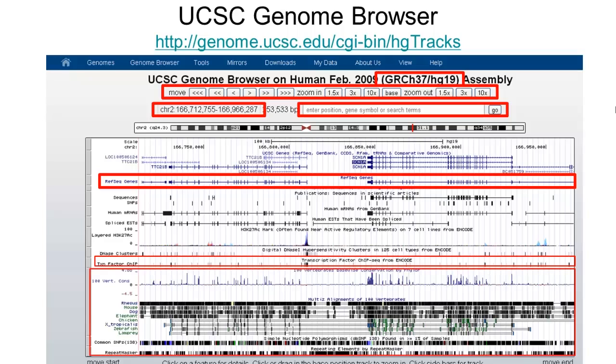An important feature of the UCSC Genome Browser is the conservation profile that it calculates across species. Here, for the human genomic region, you are looking at the multiple sequence alignment and evolutionary conservation across 100 vertebrate species. The alignments were done by LASTZ and MultiZ, and the levels of evolutionary conservation were calculated by phastCons and phyloP. Such large multiple alignments are extremely computationally intensive and impossible for small labs to do.